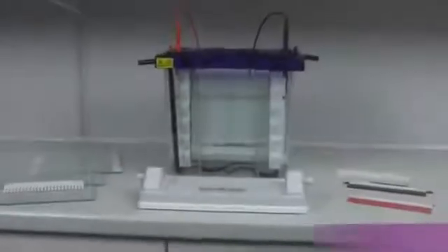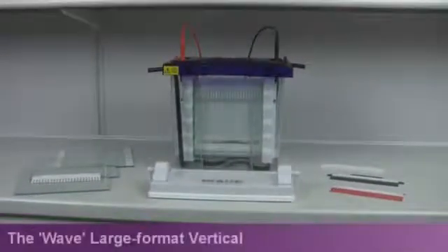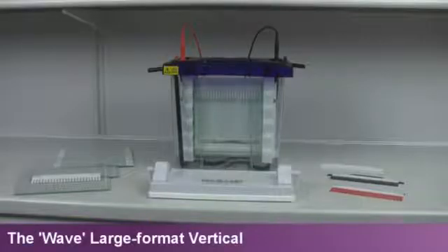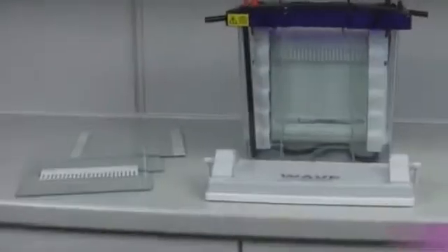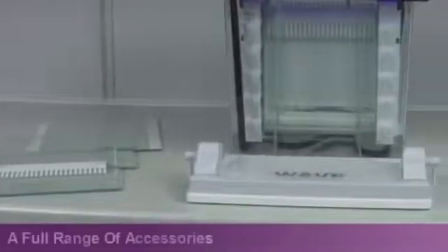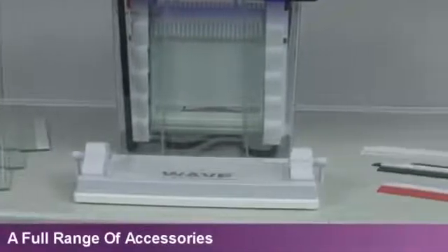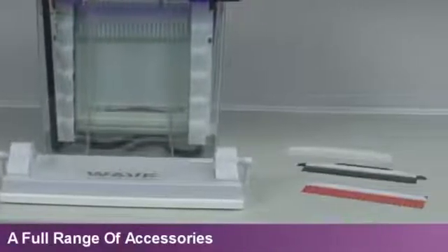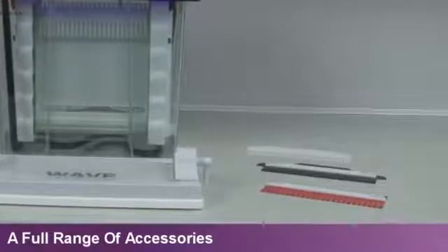The new VS-20 Wave Maxi system is Cleaver Scientific's latest product innovation for large format vertical gel electrophoresis. Each Wave system may be supplied with a full range of combs, glass plates and accessories to cast and run up to four 20 by 20 cm maxi gels.